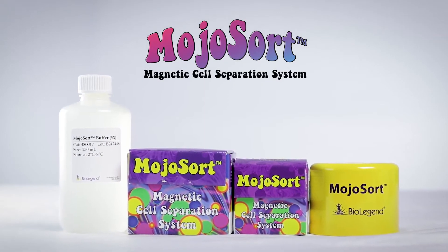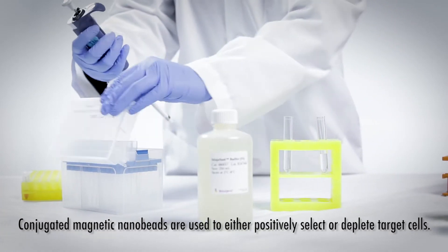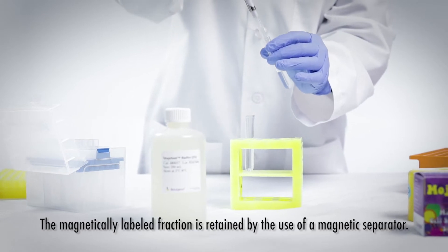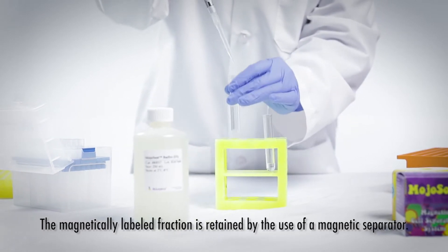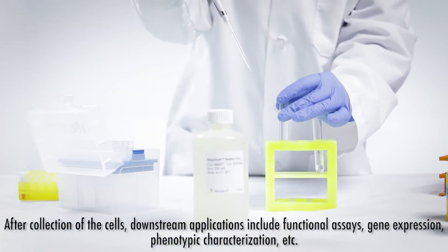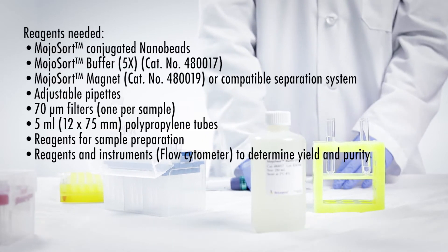MojoSort is BioLegend's magnetic separation system. The following video will illustrate a typical negative selection protocol using BioLegend's reagents and magnet. Verify you have all the reagents and equipment needed before starting the experiment.